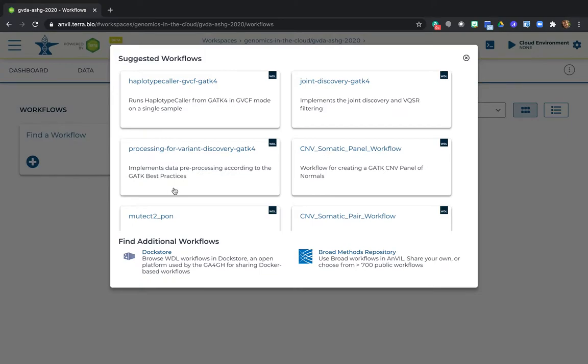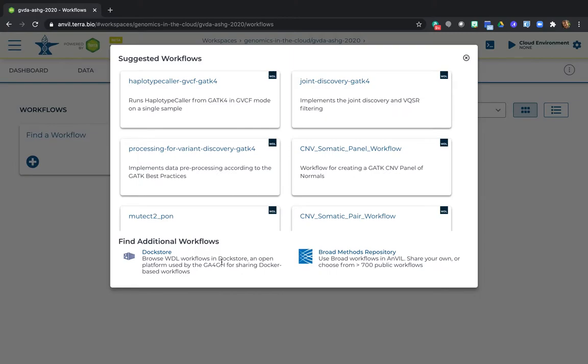Look at the bottom where it says Find additional workflows. You see two options. On the right, you see Broad Methods Repository, which is a workflow repository built into Terra. On the left, you see Dockstore, which is a separate platform that serves as a repository for containerized tools and workflows. Both repositories contain a lot of really useful workflows created and maintained by a variety of people from different organizations.